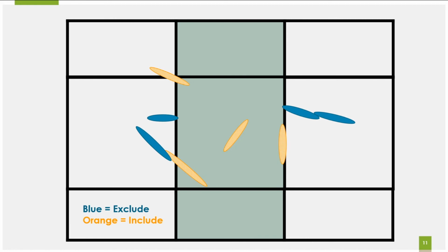But typically there will be very rare occasions. I shouldn't say it won't happen because it will, but there will be rare occasions where you'll look at a cell and say, I don't know. Usually it's either in or out. So like this orange one here, I'd say most of it's in. I don't know if this is somewhat helpful to everybody.